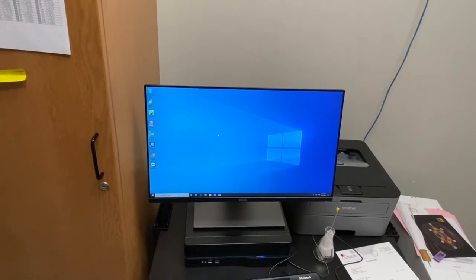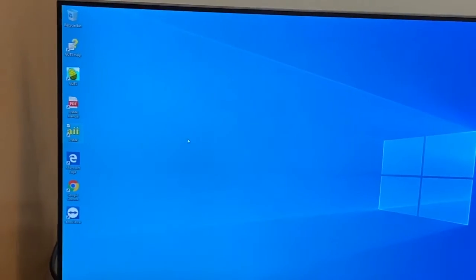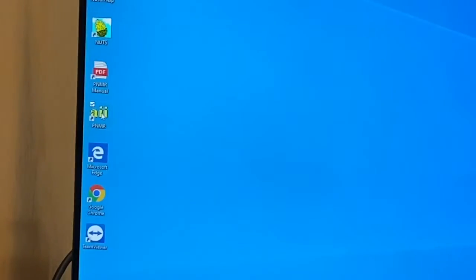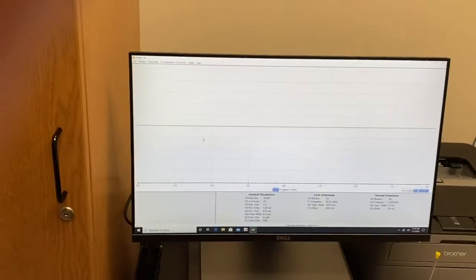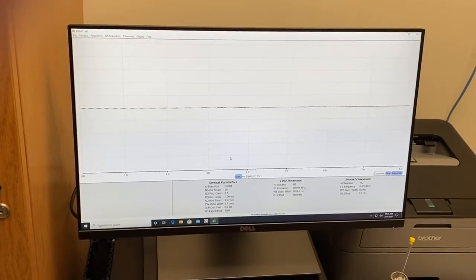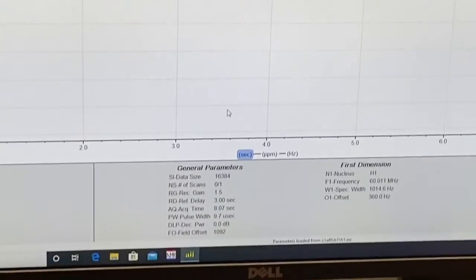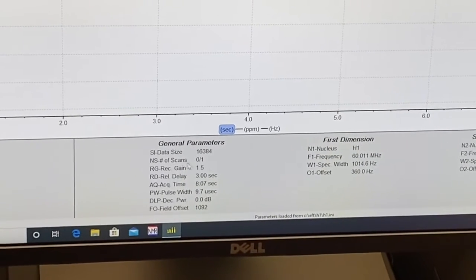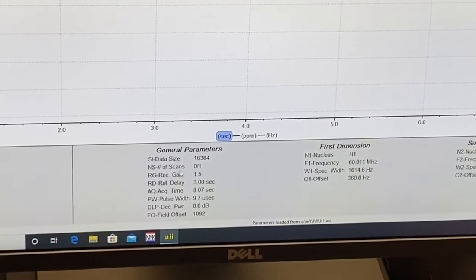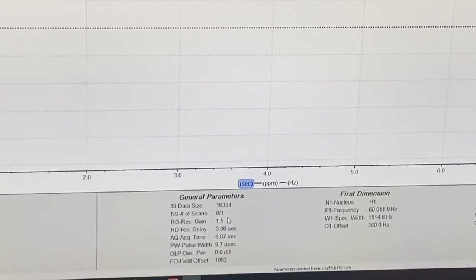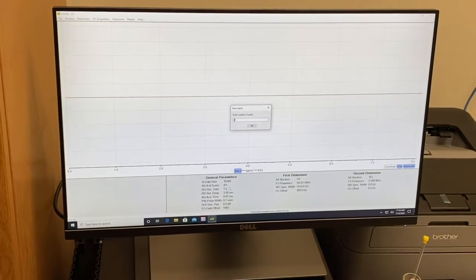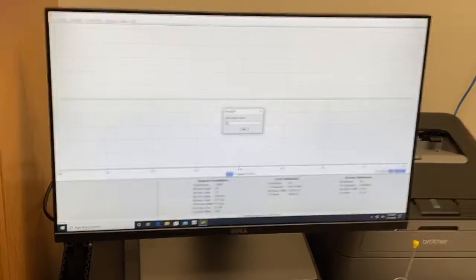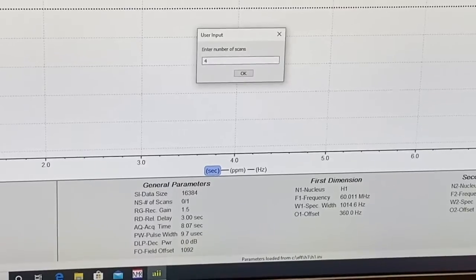Now you head over to the computer screen. You need to open the program to get the spectrum. It's called AII. It's on the desktop. Just double click. It will open a screen that's white like this. You only have to change one parameter and that is the number of scans. It defaults to one and you're going to want to have it read four. So you type in NS and then enter and change the number of scans to four and then hit OK.